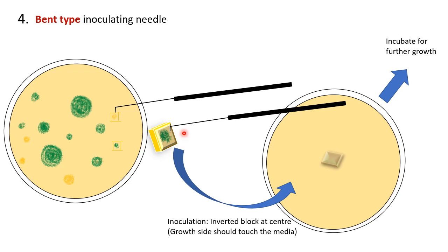After cutting the agar block with the bent needle, you can easily pluck it out using the angle of the bend. Then inoculate that agar block for subculturing. Again, the care should be taken that the growth side should touch the media plate. If you keep the agar block with growth facing upward, the colony will not grow further because the nutrient media is away from the fungal colony. Invert the block, then inoculate so the fungal culture grows properly in your new media plate.